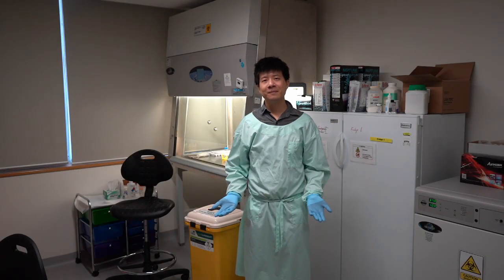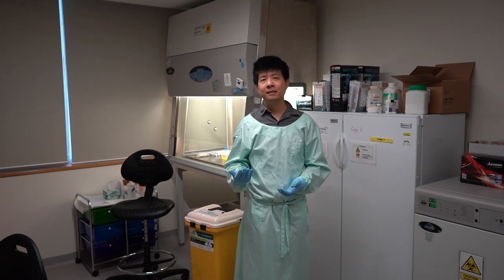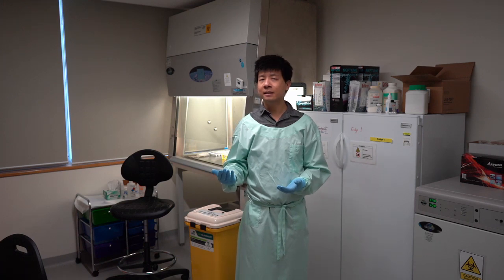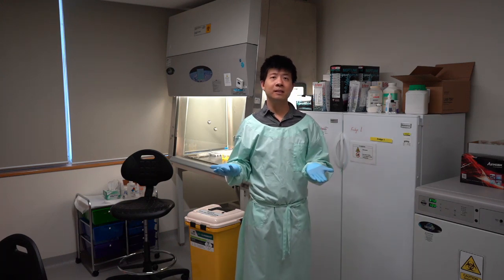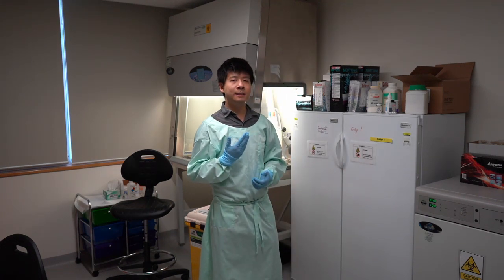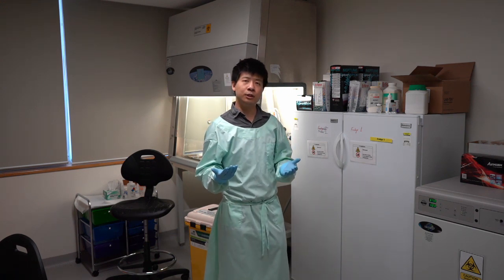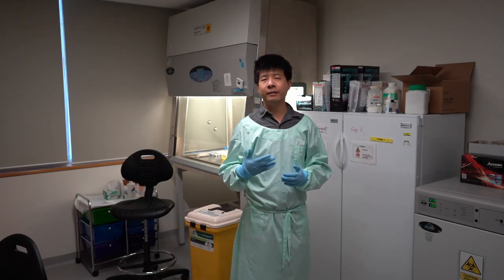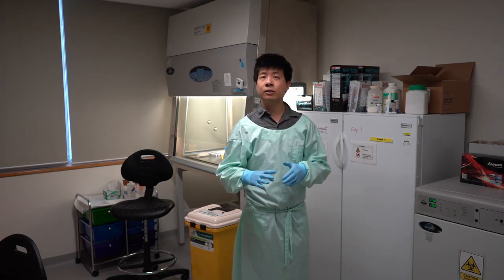Welcome to the cell culture lab. Here we culture cells outside their host species so that we can evaluate their cell behavior. In this lab, we culture cells in order to validate the various microscopes and microscope modalities that we build. To sustain cell culture, we need to keep the cells happy, and for this we require various instruments to maintain a controlled cell culture environment.